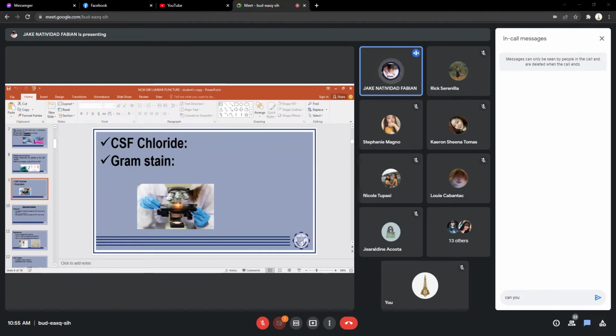What we do actually is we get a sample of bacteria, it could be from your nose, from your lips, from your eyes, and then yung agar-agar solution na nasa Petri dish, pwede mong pahiran yung ilong mo, na ganyan.